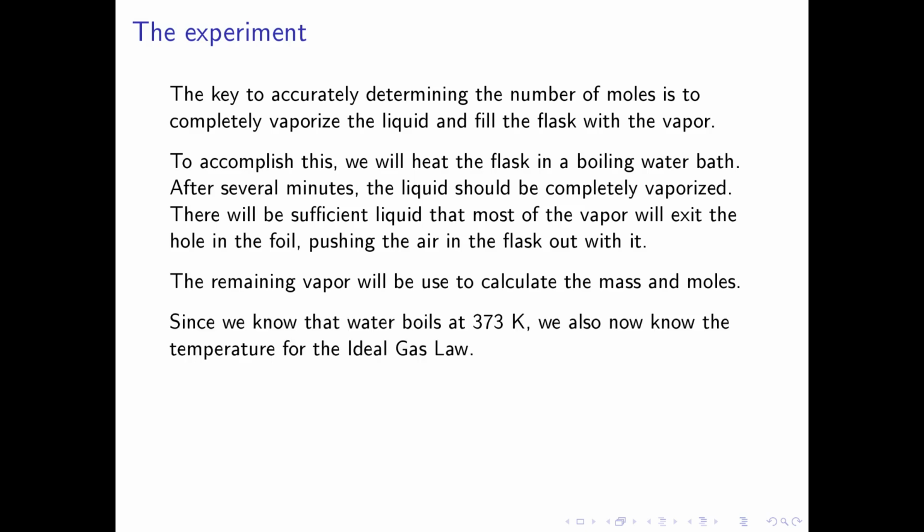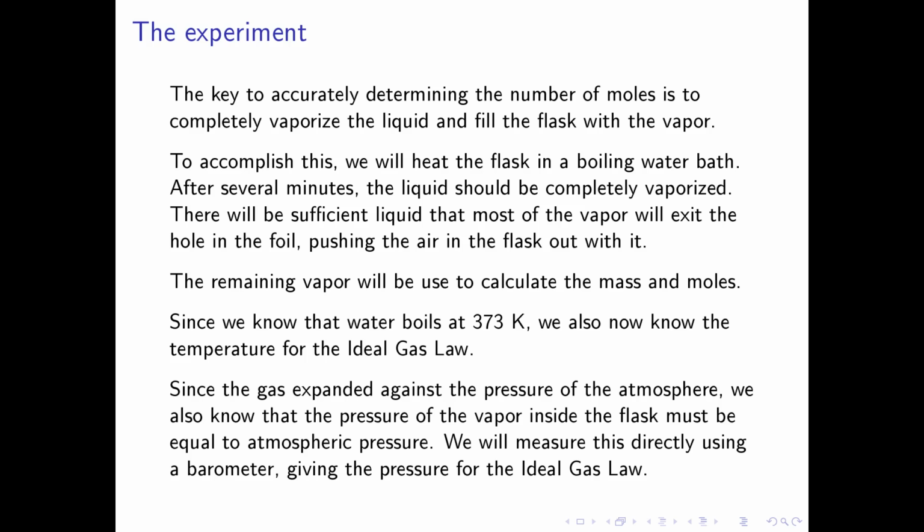Since we know that water boils at 373 Kelvin, we also now know the temperature for the ideal gas law. Furthermore, since the gas expanded against the pressure of the atmosphere, we also know that the pressure of the vapor inside the flask must be equal to atmospheric pressure. We will measure this directly using a barometer, giving the pressure for the ideal gas law.